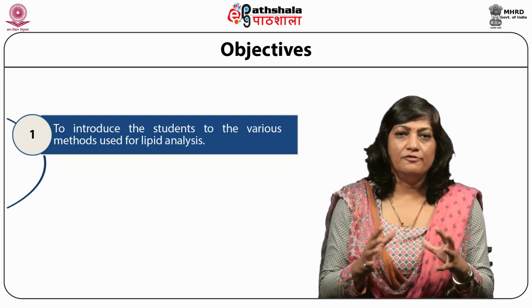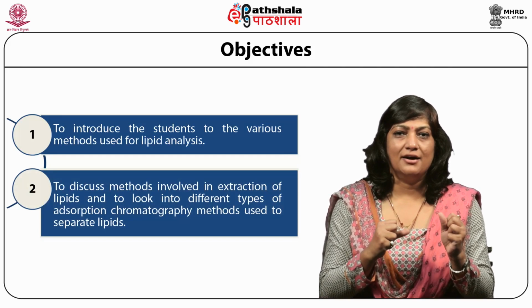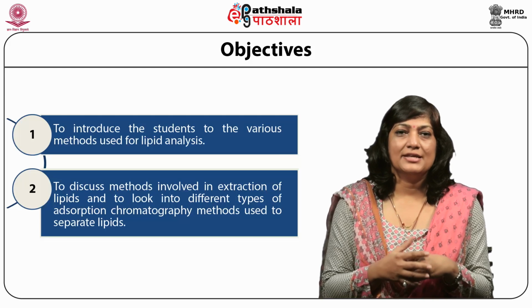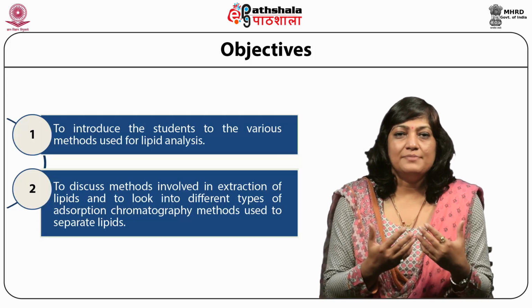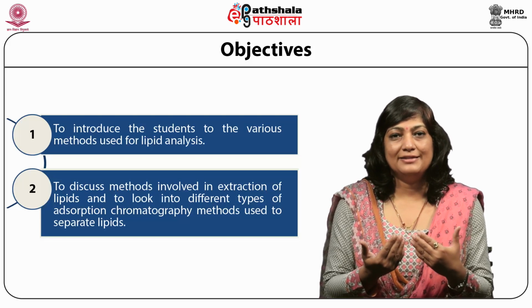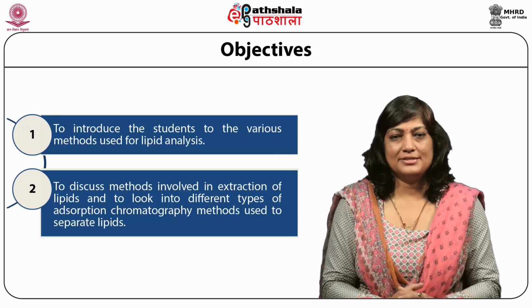And this module will involve the discussion of methods that are basically used in the extraction of lipids, and to look into different types of adsorption chromatography methods that are used to separate lipids. And then we will look at methods that are used to analyze lipids subsequently.